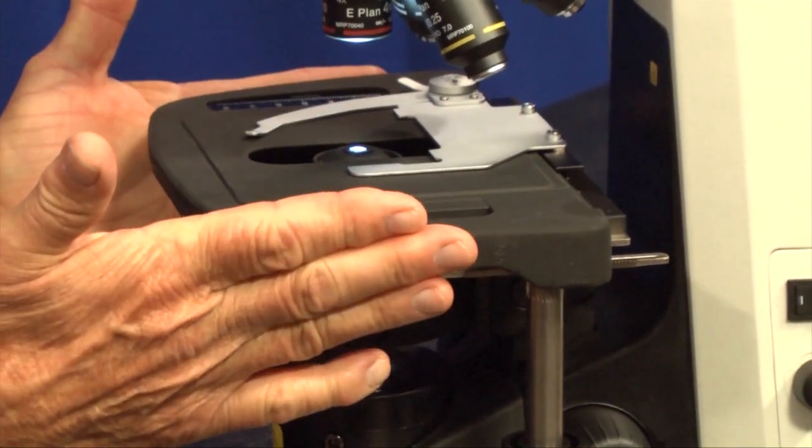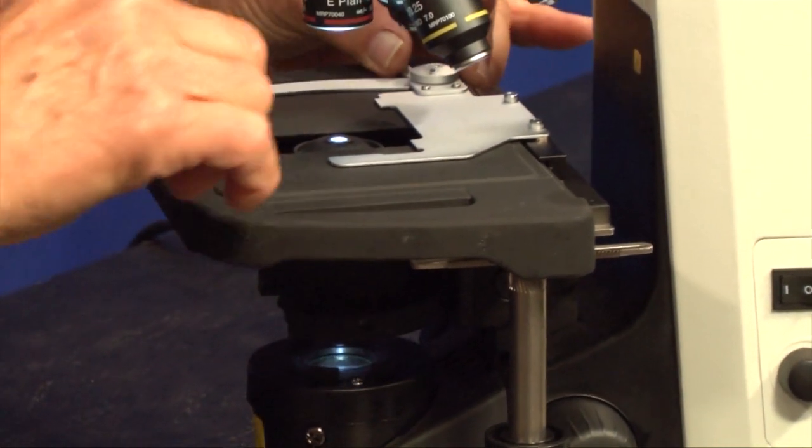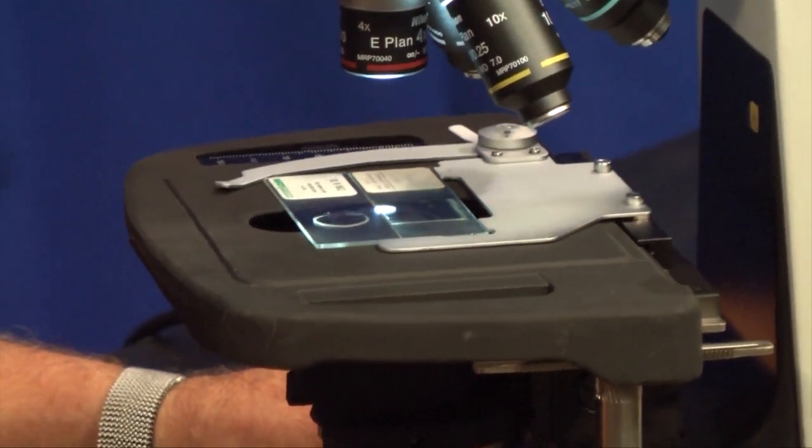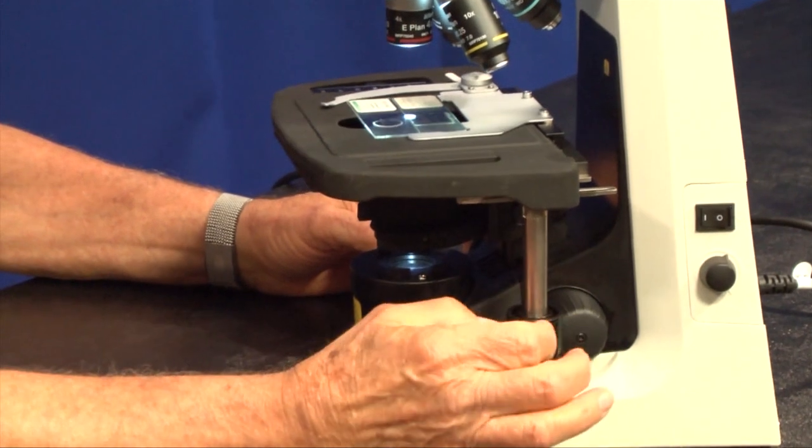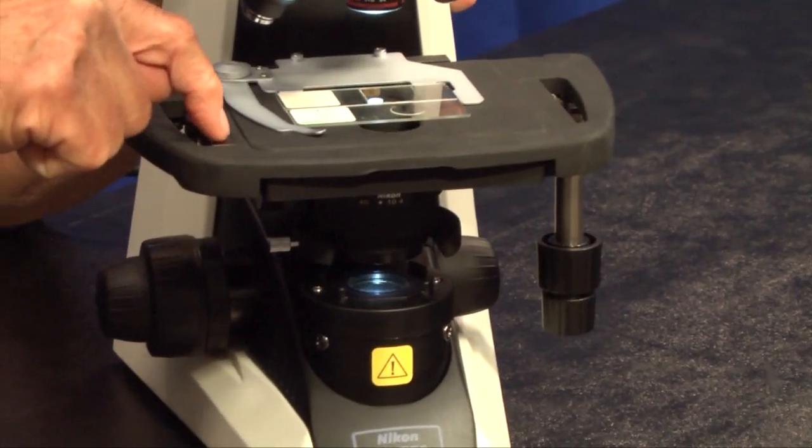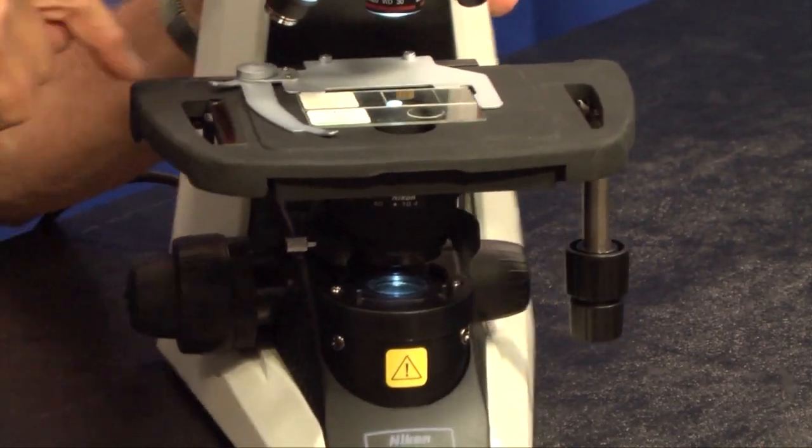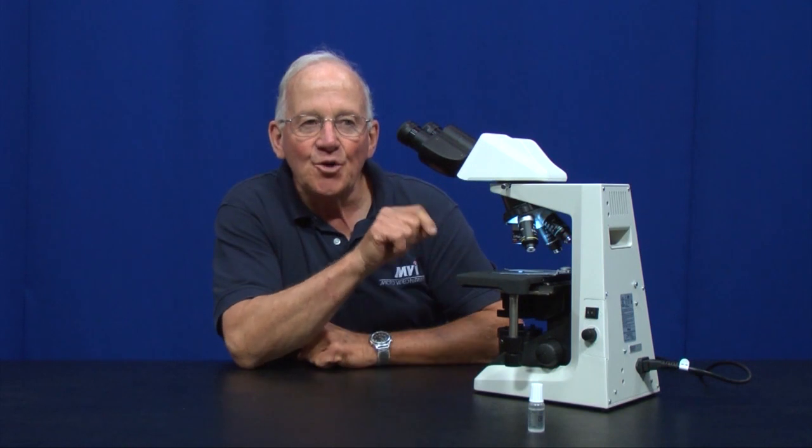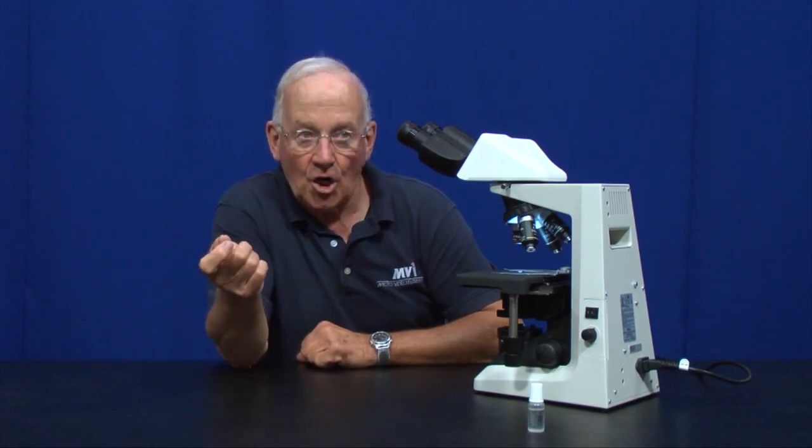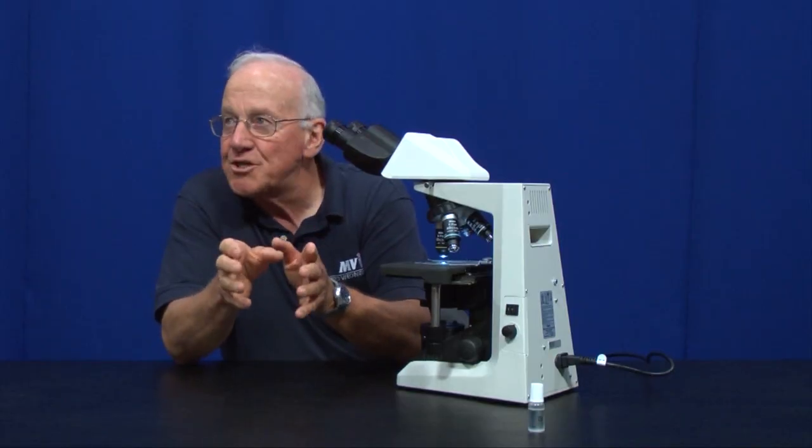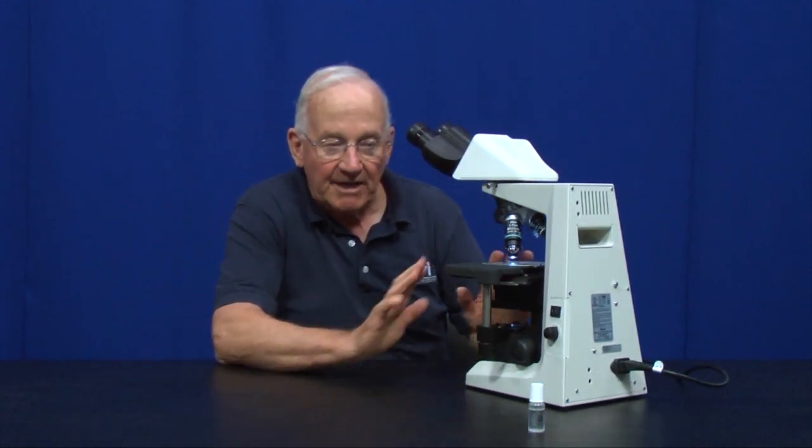The next thing we're going to talk about is the stage of the microscope. The stage is the device that accepts the slides and allows you to move the slide in an XY direction with its low drive XY shaft right here. The stage is also graduated with gradations on the side and in the back. Its only purpose is that if you find something on a slide that is very interesting and you wanted to show a colleague, you could denote the location of it. That's the purpose of a graduated mechanical stage.